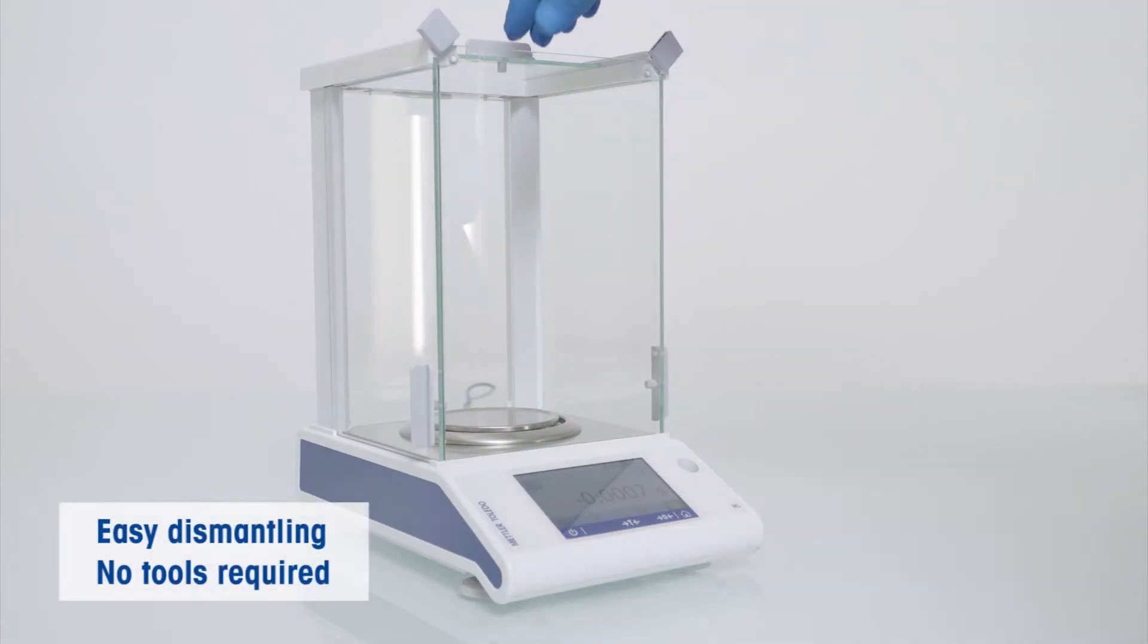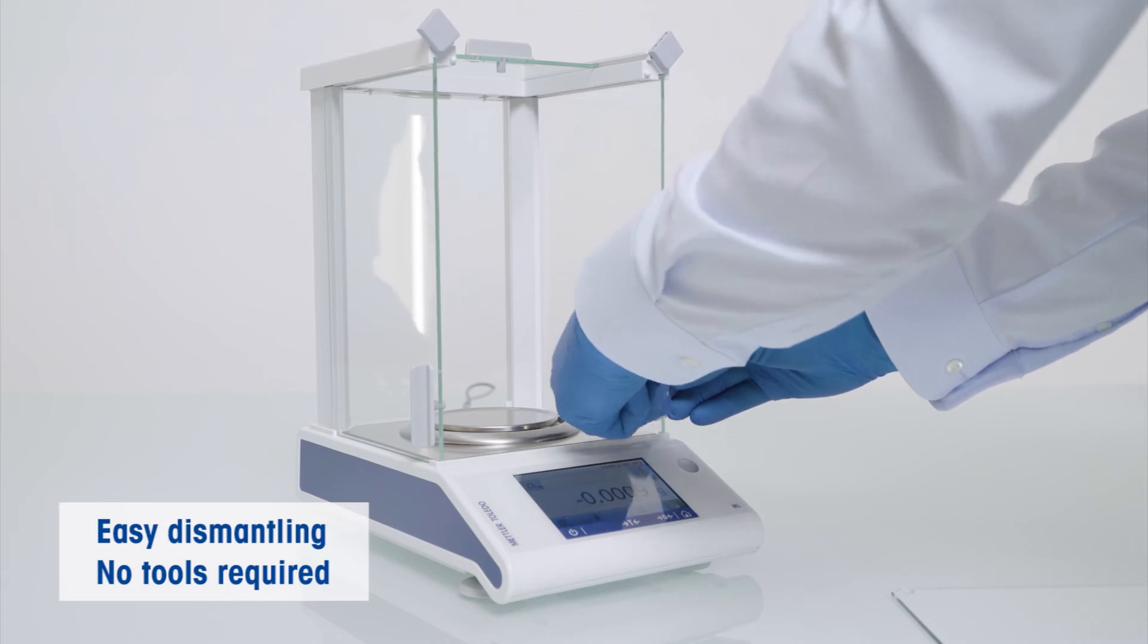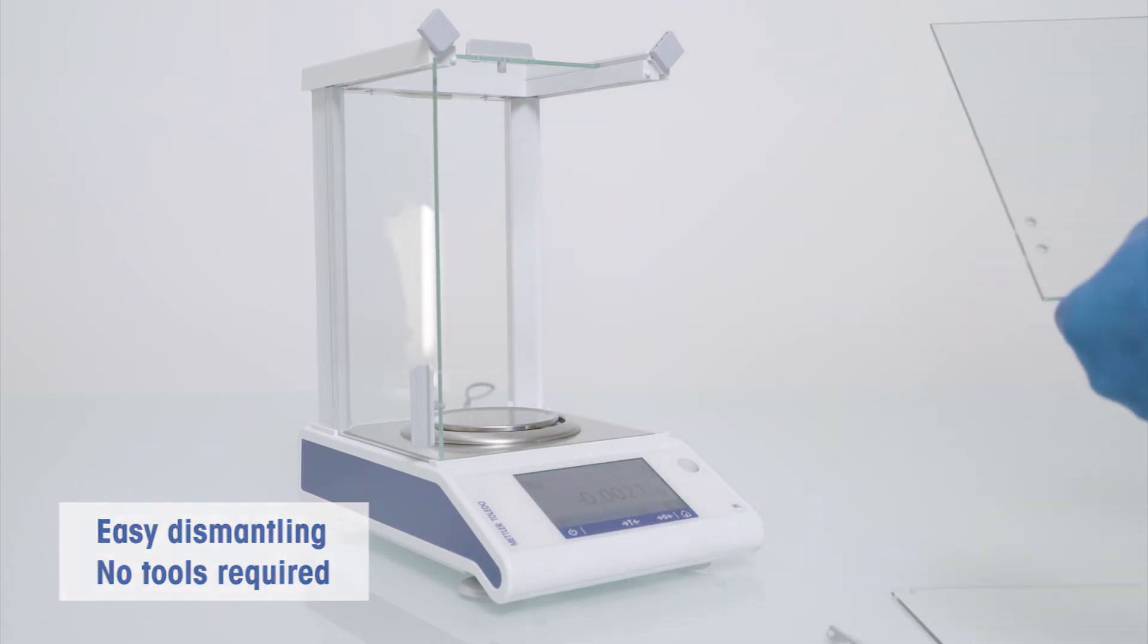The surfaces are large and flat, and the draft shield panels can be easily removed without any tools, which makes them easy to clean.